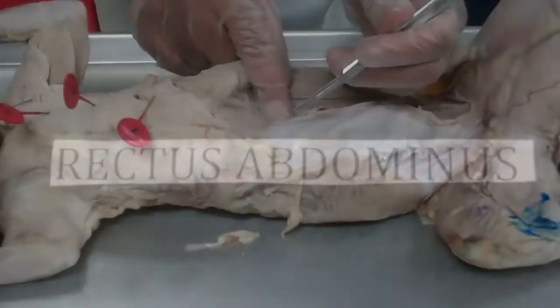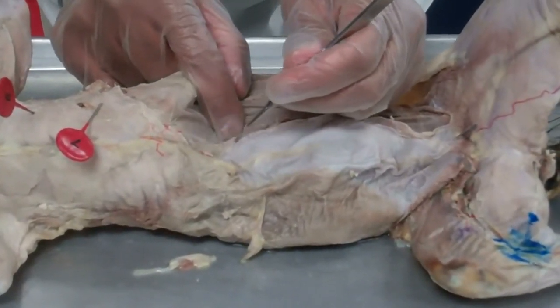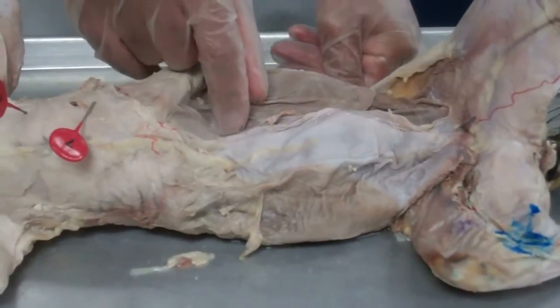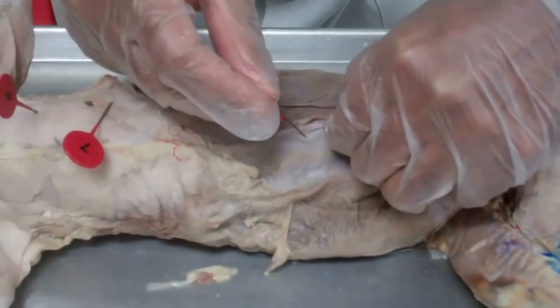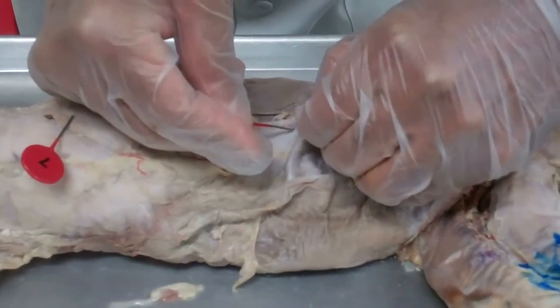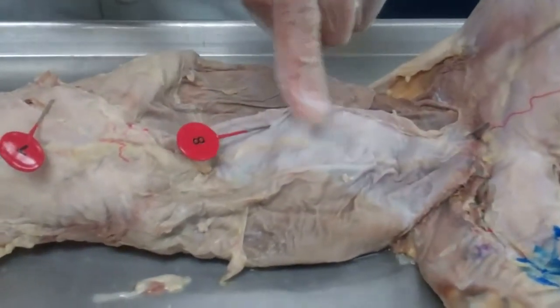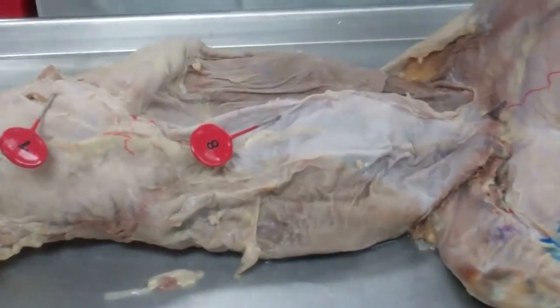Rectus abdominis. The rectus abdominis. And that's going to be this superficial muscle closest to the surface. Just right here. It's going to be the rectus abdominal muscle. And the muscle is going to be covered with a lot of fascia that has to be peeled away in order to see the actual rectus abdominal muscle.